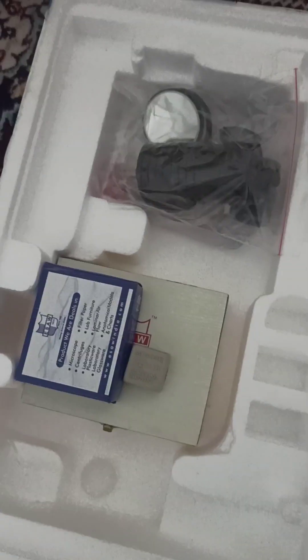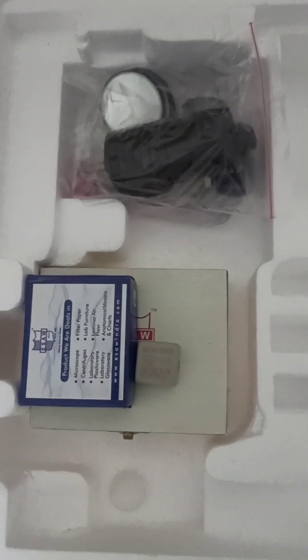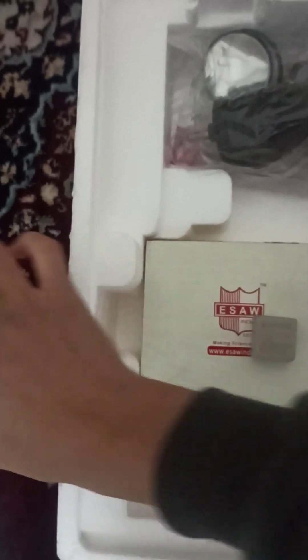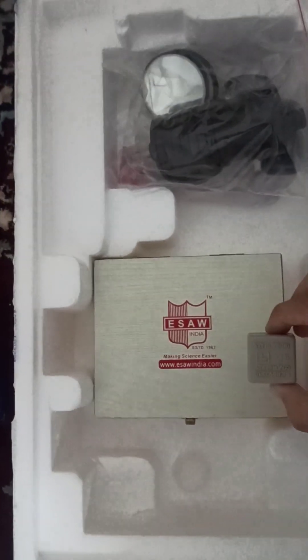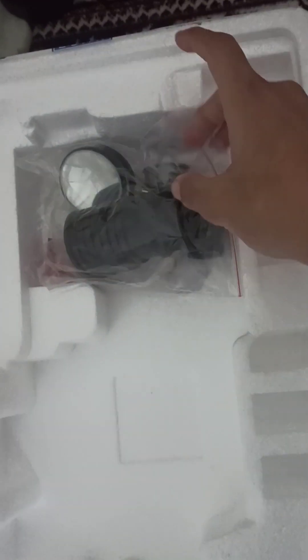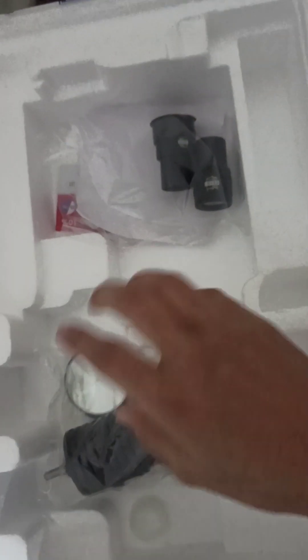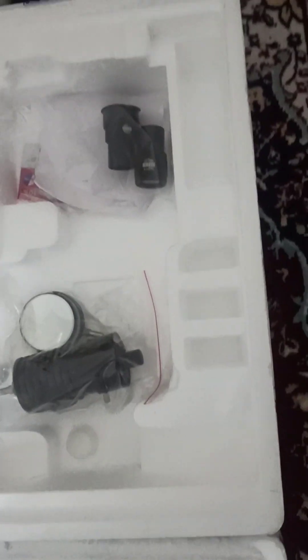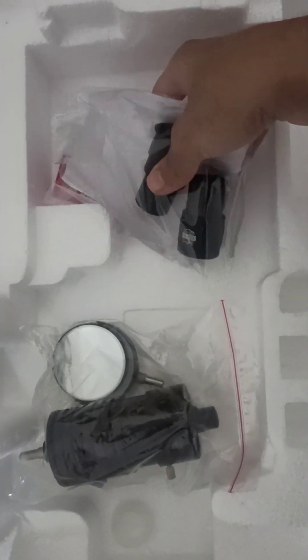Here we have the other items provided by ESAW with the microscope. We have slides — these are cover glasses and these are some pre-prepared slides, which I will show you. Here is an LED light, and here is a plane and a concave mirror for focusing.